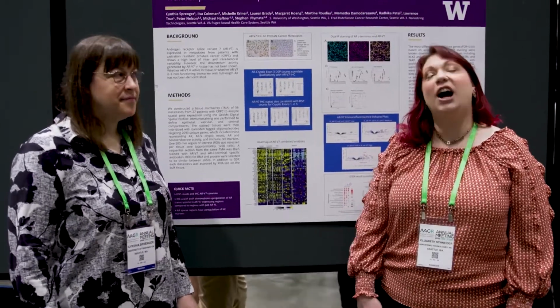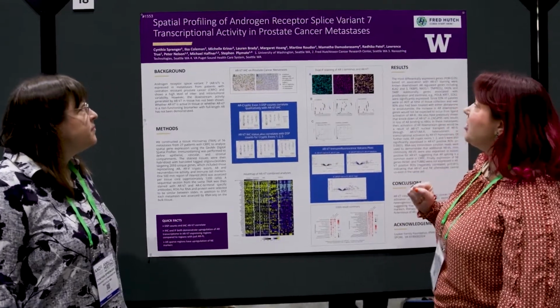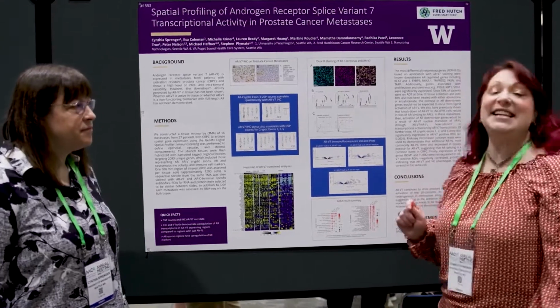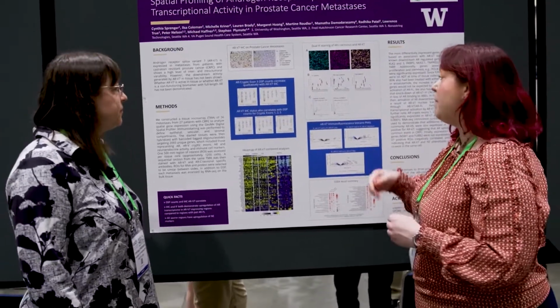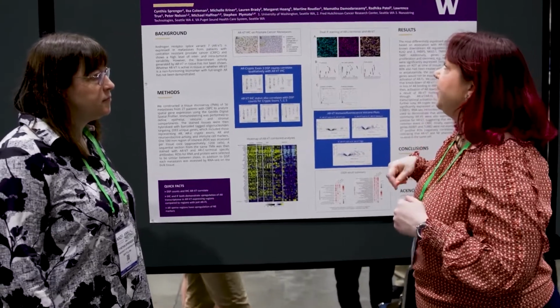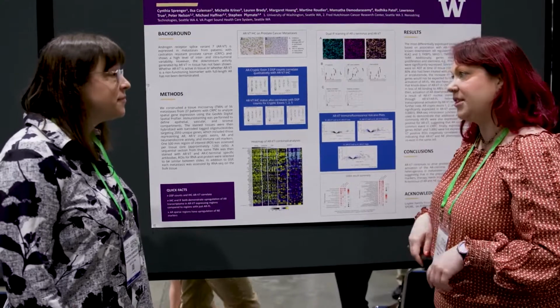Today she is going to talk about her poster, Spatial Profiling of Androgen Receptor Splice Variant 7 Transcriptional Activity in Prostate Cancer Metastases. So Cynthia, I'd love for you to talk a little bit about your experiment. Why did you want to do spatial profiling of androgen receptors in prostate cancer samples?